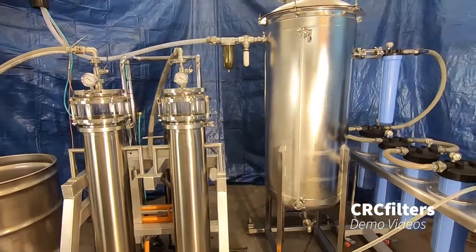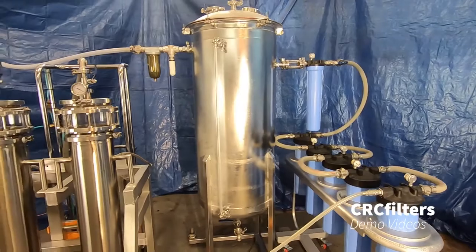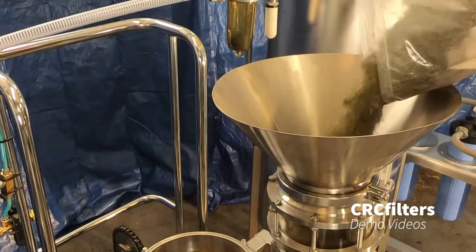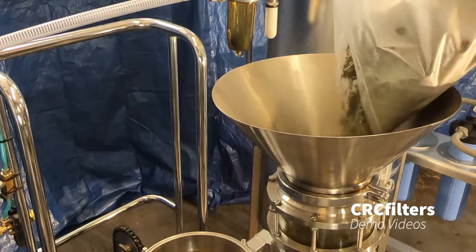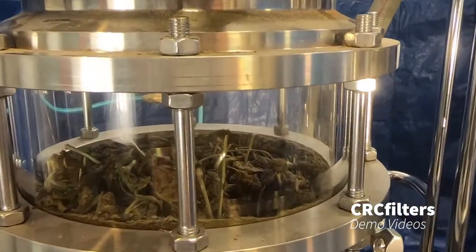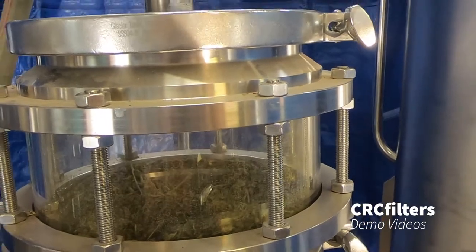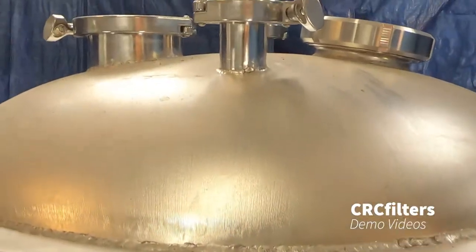Now that we've run through the components, I'll do a quick demo. We'll get some material in there and run some alcohol through it. We've got our material in here, we've got our vacuum pump started, so we're going to continue building vacuum while we get our alcohol ready.